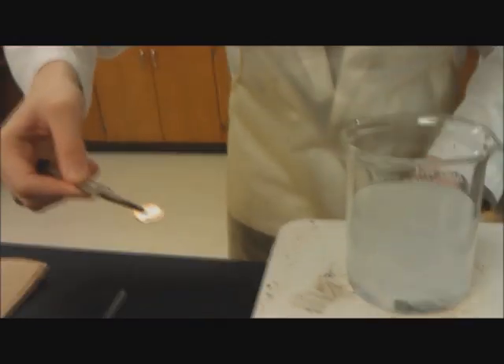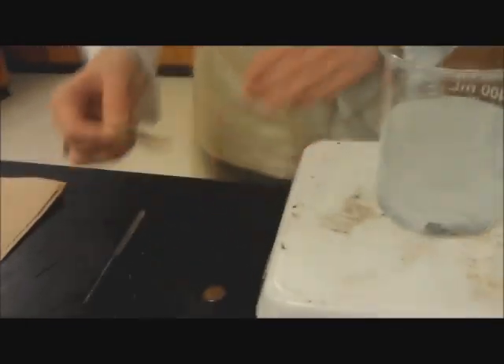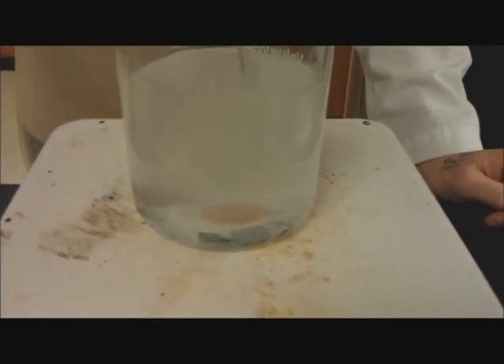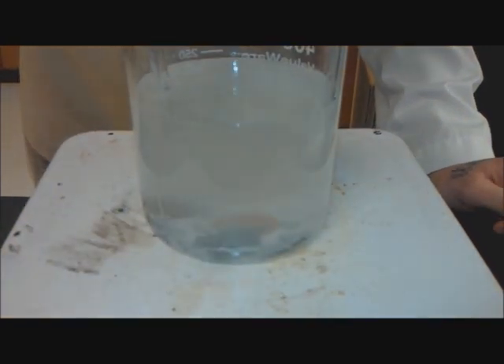We're also using one pre-1982 and one post-1982 penny to see if there's any difference with the different compositions of pennies. There we go — it's starting to get a little bit clearer. I'm just going to move the zinc over so it's actually contacting the pennies for sure.